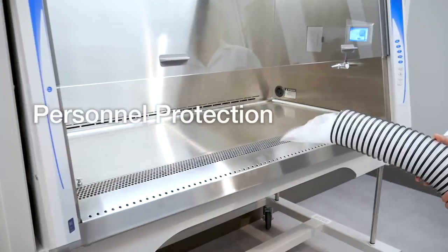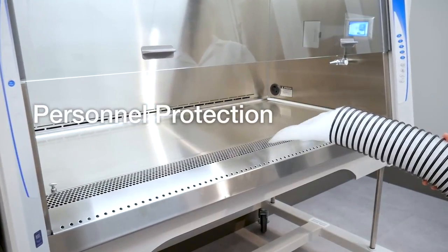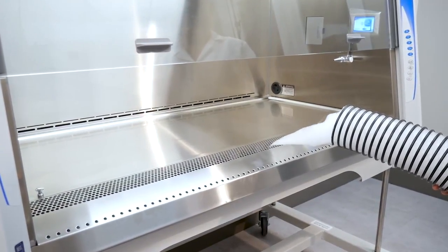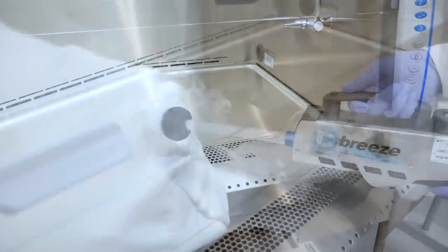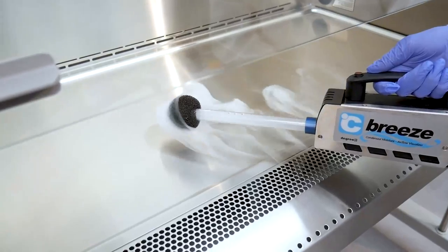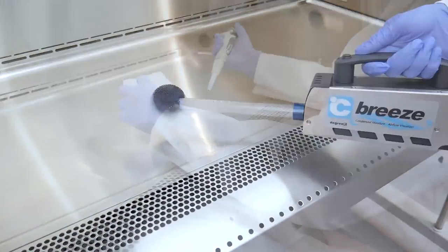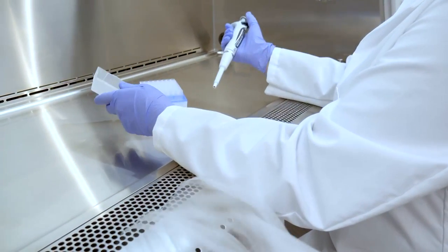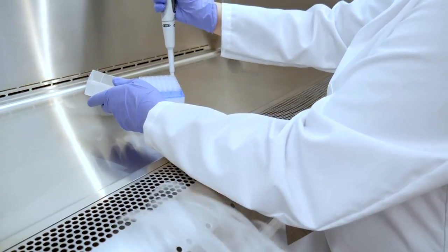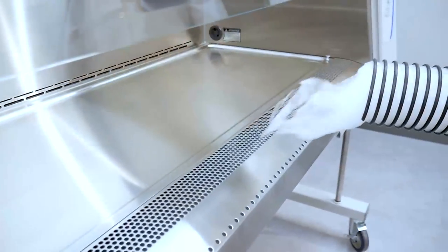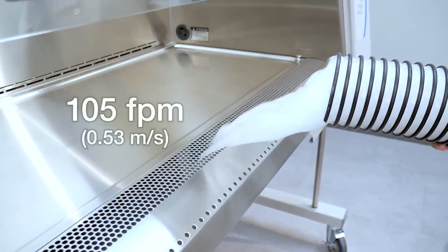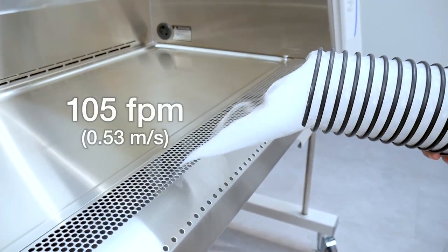A BSC provides personnel protection to protect a user during working operations. Room air is drawn into the front inlet of the cabinet where it meets contaminated air captured from within the cabinet interior. This air, known as inflow air, is drawn under the work surface and is then recirculated or exhausted from the BSC. Inflow air has a typical velocity of 105 feet per minute.